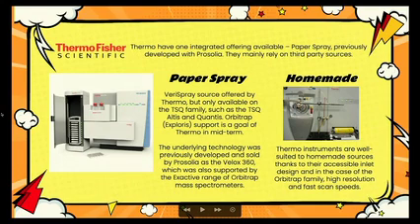You know, the source is pretty accessible physically. It's easy to get to the source. It's not covered by bits of plastic, and you don't have all the desolvation stuff getting in the way. It's relatively easy to get to, and you can put stuff in front of it. The ion optics immediately behind tend to be pretty robust. They don't tend to get too dirty too quickly. And you've got all of the usual Orbitrap benefits of high resolution, so not having chromatography is less of an issue, and you've got pretty fast scan speeds and things.